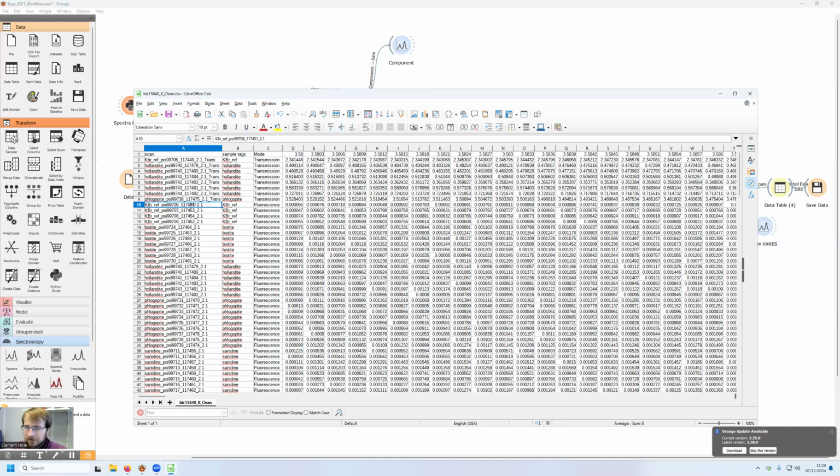Then in the column sample tag, you will have the name of the sample as it was declared in the query. And finally, you will have a column that is usually called sub-sample tag, and this is the tag that you manually input via the query when you input the tag on the point.